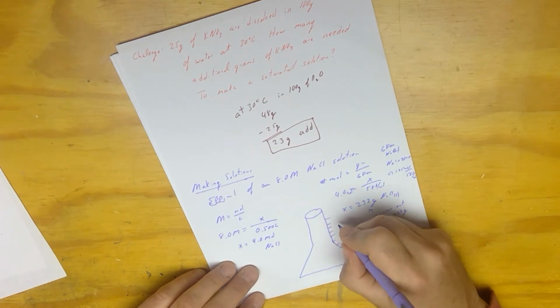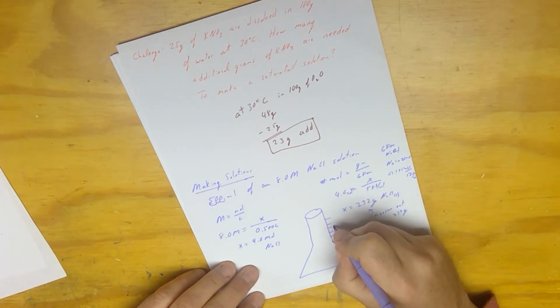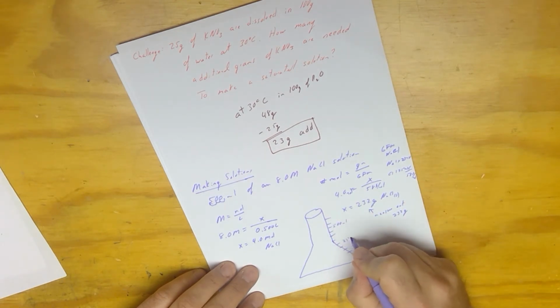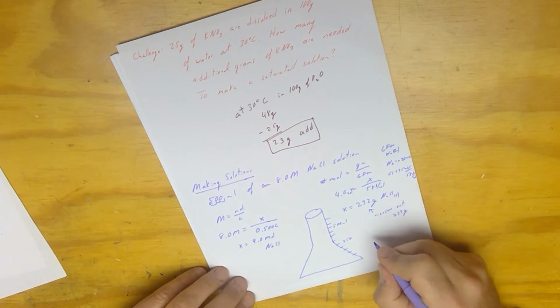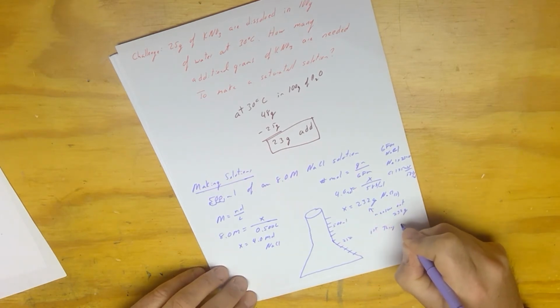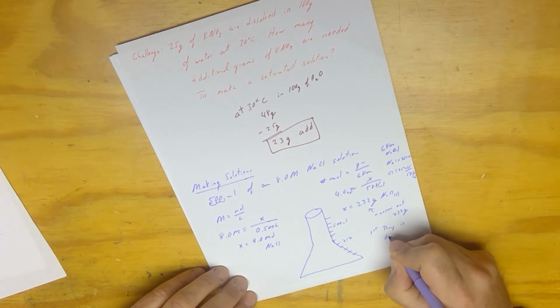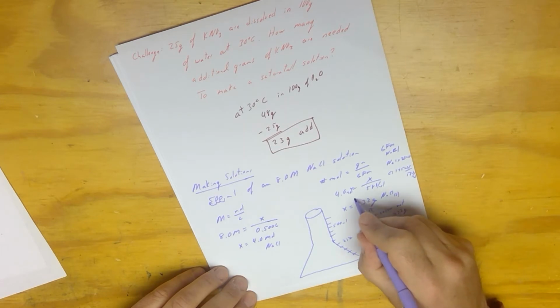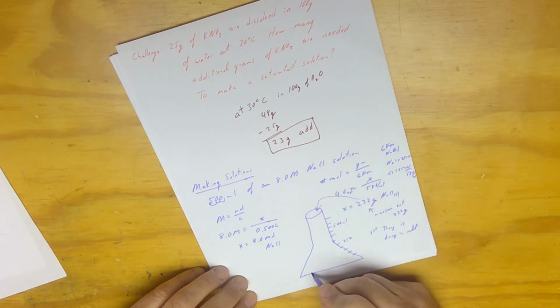So let's say that this is 500 milliliters right here, maybe 250 here. The first thing you do is dump in the salt. We put the salt in first, so it's down here on the bottom.